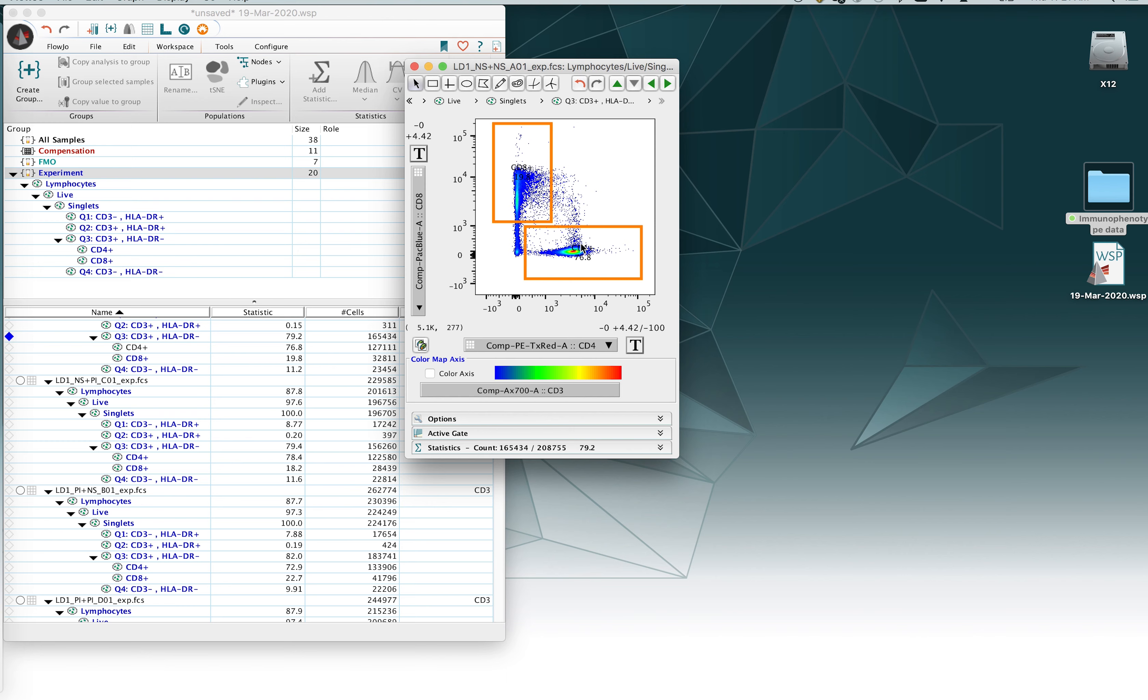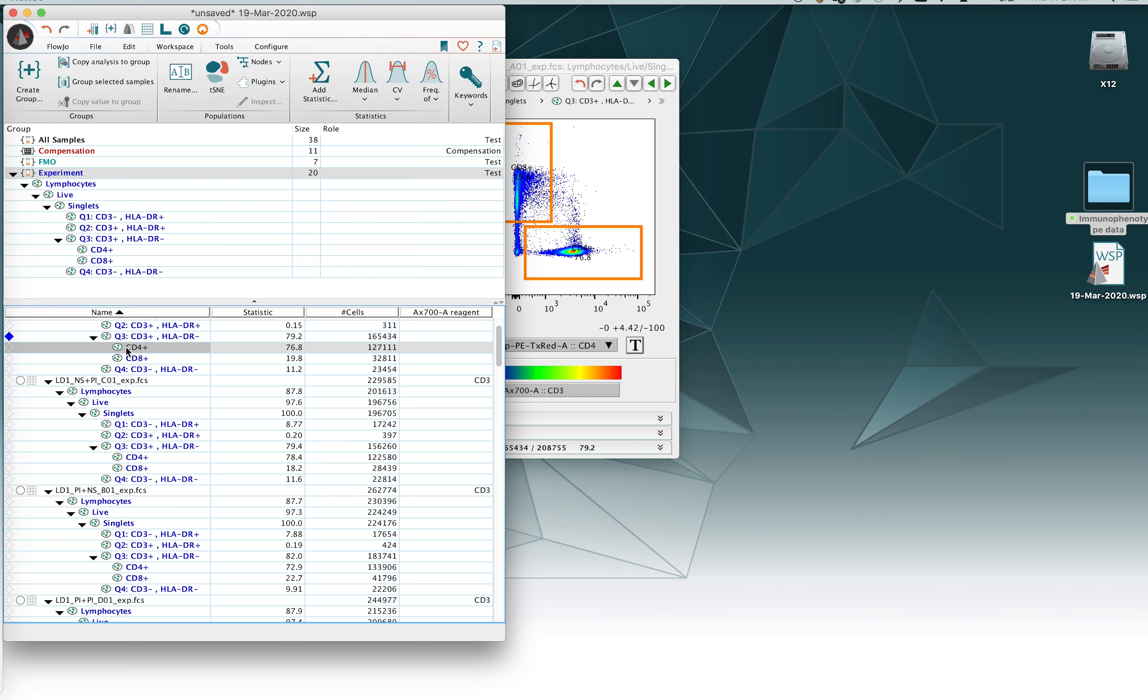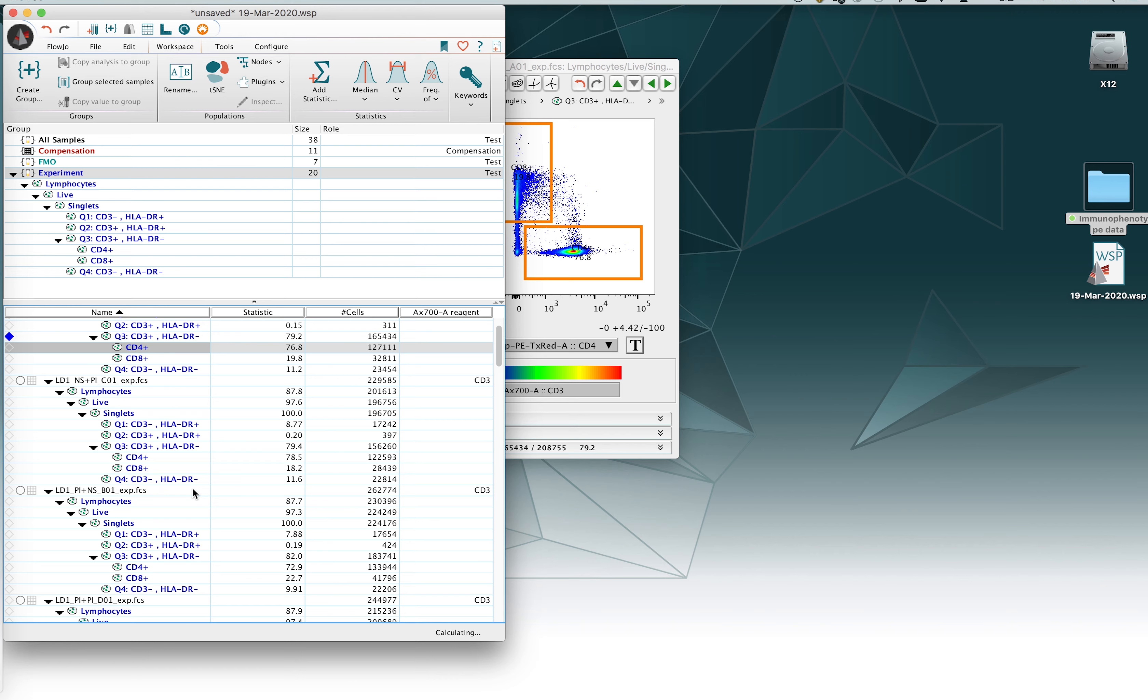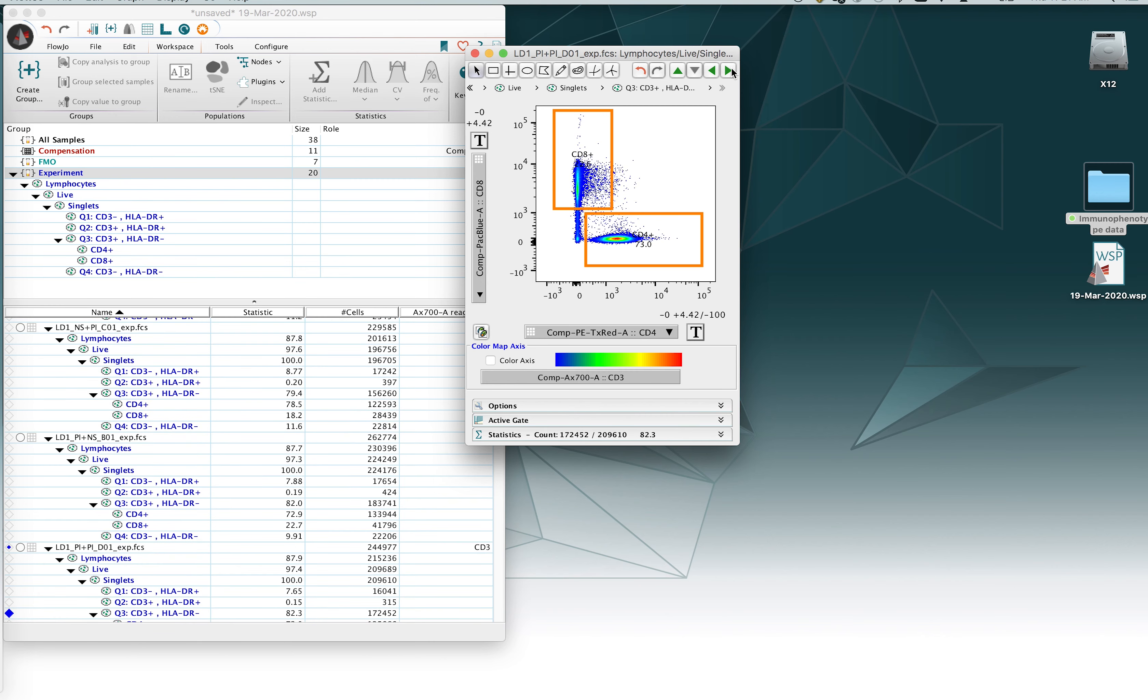If we want to update the rest of the files so that they have this gate instead of the initial gate, what we need to do here is highlight that new CD4 gate, the one that's in the black plain type font, highlight it, and then right click on it and say copy analysis to group. And this will go ahead and update the workspace so that all files now have that elongated shape.